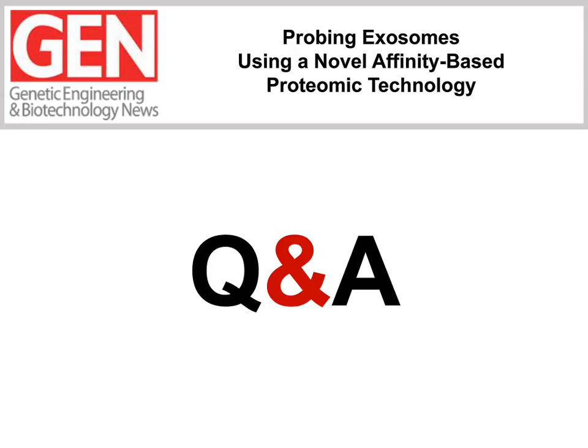Okay, and Aled, another question. What's the best strategy to isolate exosomes from plasma or serum? Which is the best, plasma or serum, and how do you assay the purity of exosomes? It's a mouthful. Well, this is a million-dollar question. We don't know. We've tried for a long time over the last 2 years to develop a workable methodology, something that is not too clunky and cumbersome to make it unworkable for clinical samples, but also gives a product that's fairly pure.